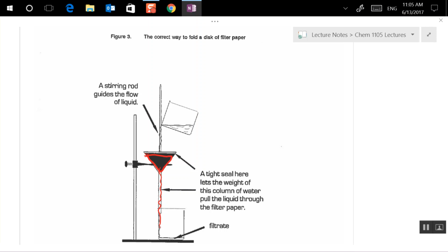Potentially I have. I can't see it because it's in water, but I'm assuming that if there was a water-soluble thing, I have separated it. Okay? Then I can take this and move it over another beaker, and I can add some acid onto this filter. My solids are already on the filter, right? And then I dump some acid on there. You're actually just going to use a disposable pipette and squirt the acid on there.